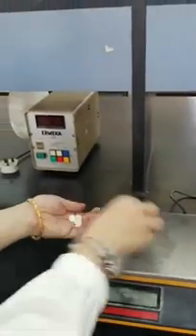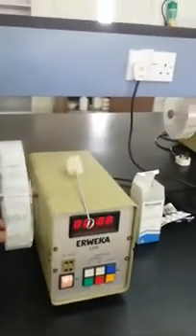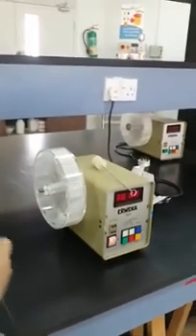Friability: we take 11 tablets and weigh them. Then take these tablets and put them in a friabilator. Close it.